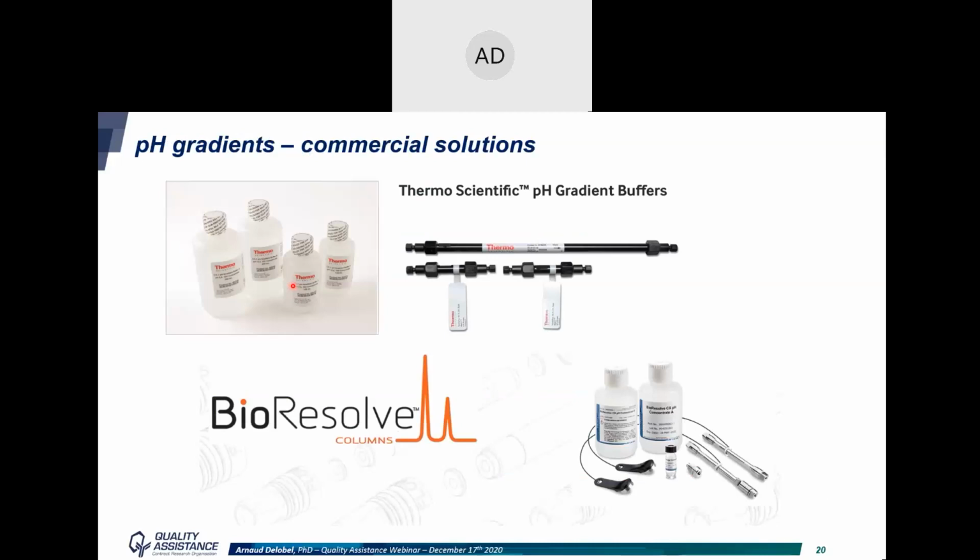So if you want to have a method development that is much simpler, in that case, you can use pH gradients. And as I explained earlier, doing pH gradients by hand is not something that is quite easy, especially if you want to get a linear pH gradient. So you can use different commercial solutions that were commercialized. So Thermo Scientific has commercialized pH buffers that can be used with their columns, but also with columns from other vendors that give nice results.